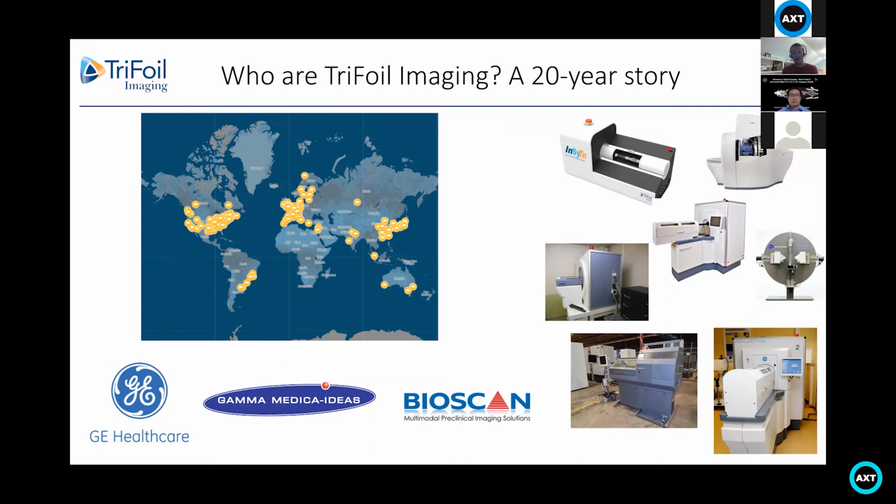And our mission, as I say, exclusively for the last 3 or 4 years, has been to make sure that optical imaging can deliver a full body 3D alternative that can either take the place of radionuclear imaging where it's not possible, or verify it where that is required.